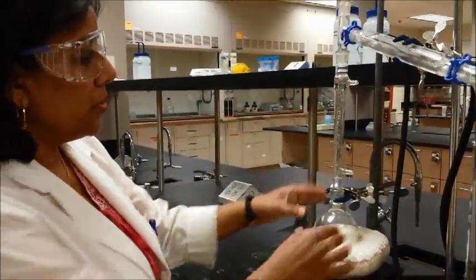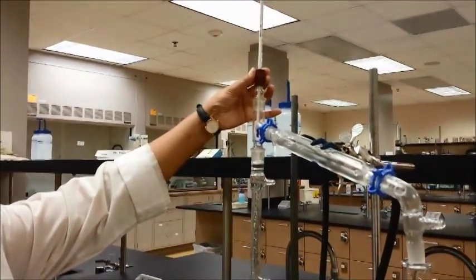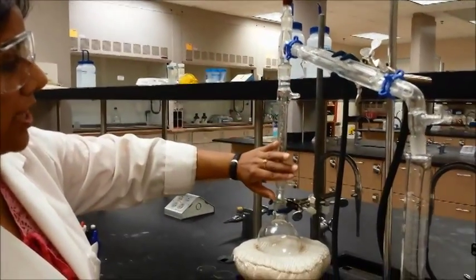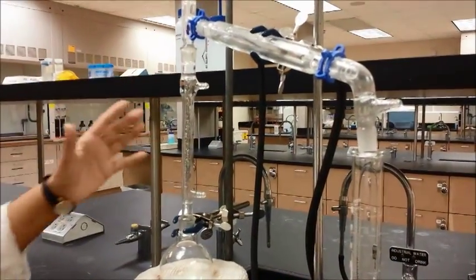You will need the fractionating column in between your round bottom flask and the three-way connector. You still need a thermometer as you would in a simple distillation. If you were to remove the fractionating column, everything else is going to be exactly the same as simple distillation.